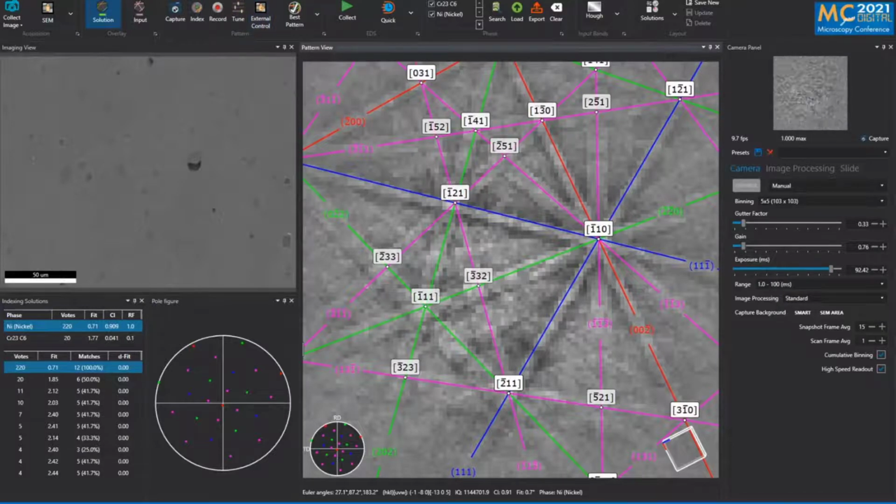Now, finally, what I can do here, I can drop the high tension. I was at 20 kV before. Now I'm going down to 8. So let me just again check my microscope image.